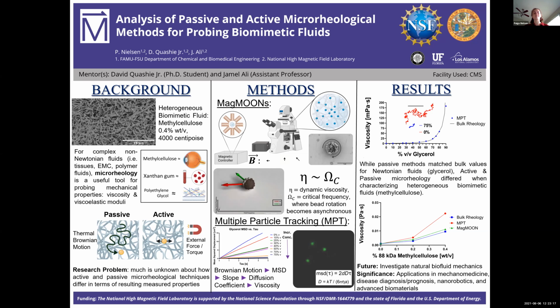The structure and mechanics of biofluids can often have broad implications for medical technologies. Bulk rheology is often used to characterize the mechanical properties of fluids in response to external stimuli. However, when examining heterogeneous cellular microenvironments, rheological characterization at smaller length scales is needed to probe their local properties.